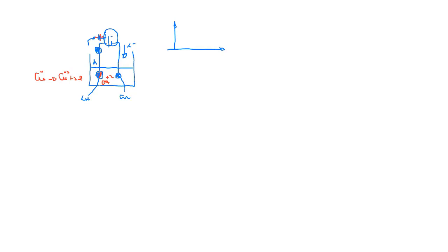And we calculate and plot the data of the cumulative number of electrons and moles of electrons after each time interval. So the x-axis is the number of moles of electrons. Very good. This is a quick overview, so you know the general idea.